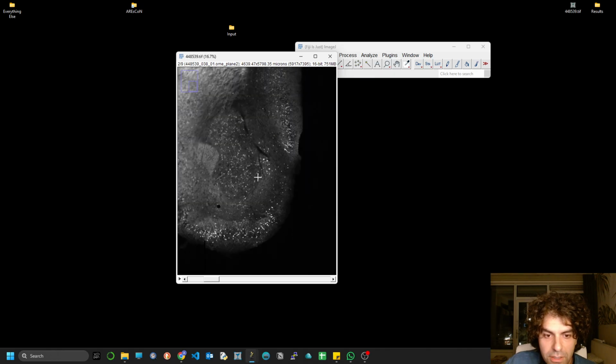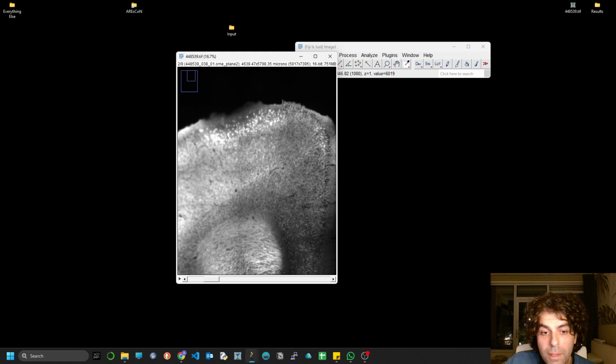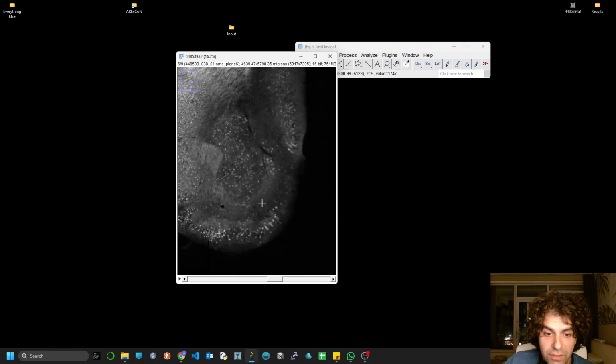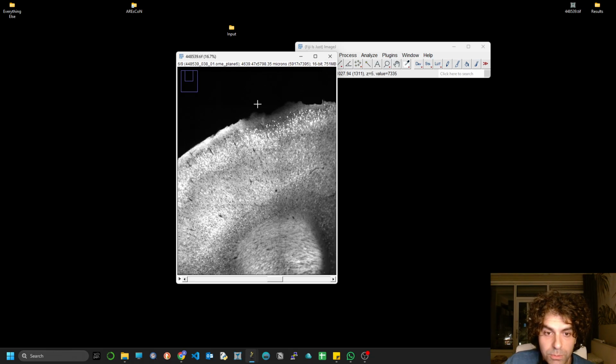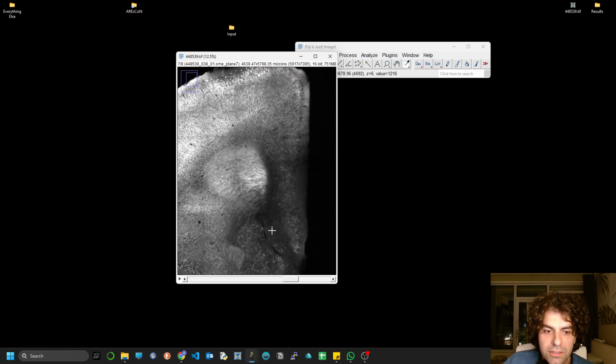You can see how clear this is, but at the same time if you go above, it's rather dim. Moving through the planes, the picture changes, so you have dim observations at the lowest part and bright, crisp observations at the highest.